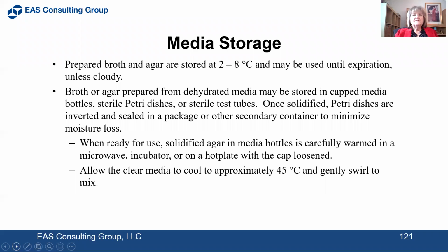When ready for use, solidified agar in media bottles is carefully warmed in a microwave, incubator, or on a hot plate with the cap loosened. Then you allow the clear media to cool to approximately 45 degrees C and then gently swirl to mix.